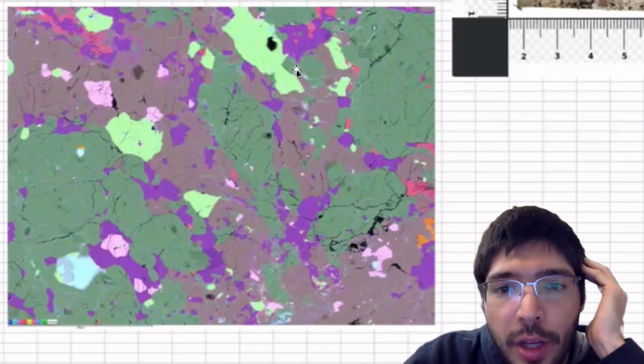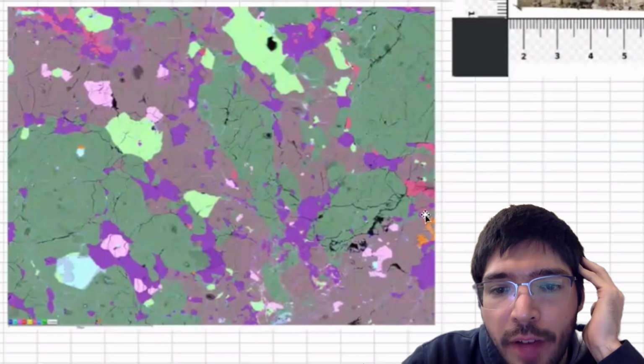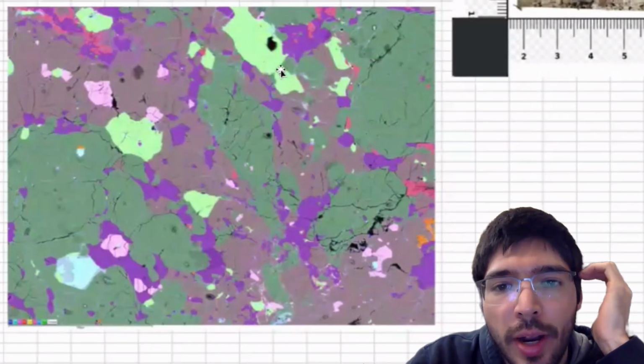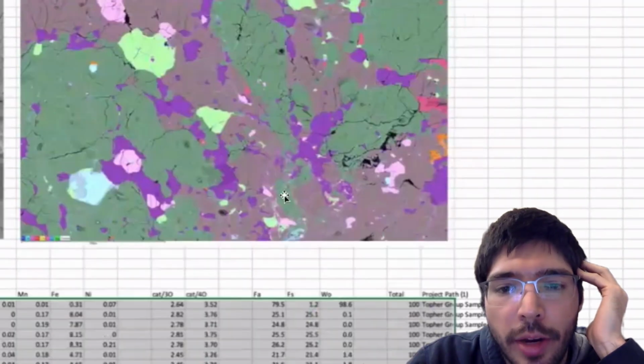We have very large troilite, very large chromite, very large metal. And we have calcium phosphate, which is the orange. These are all diagnostic things you see in very equilibrated chondrites, where we're coarsening the grain size of these metals and sulfides, and we're forming phosphates and chromites and feldspar. And this is a typical equilibrated chondritic texture.